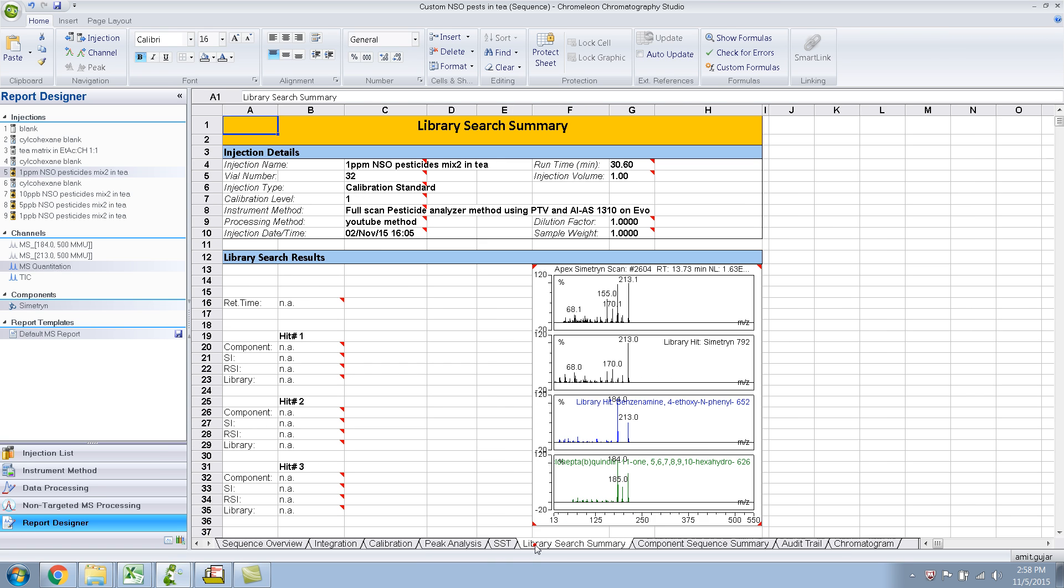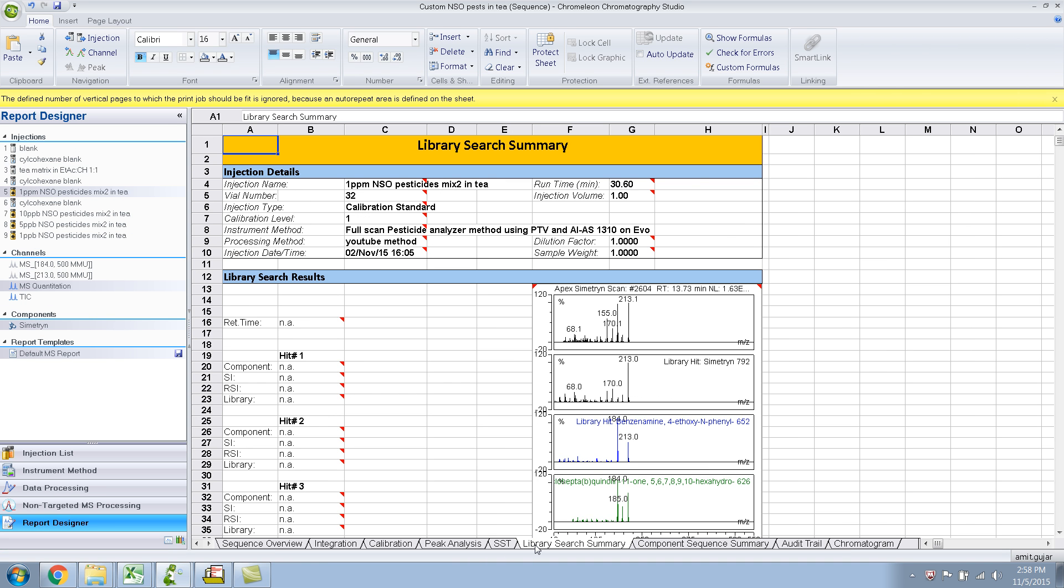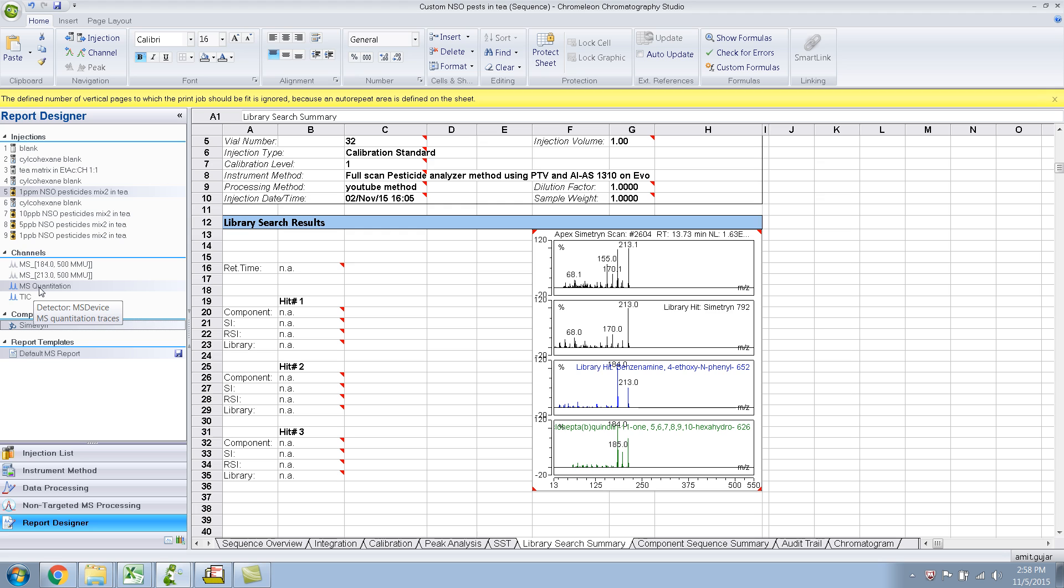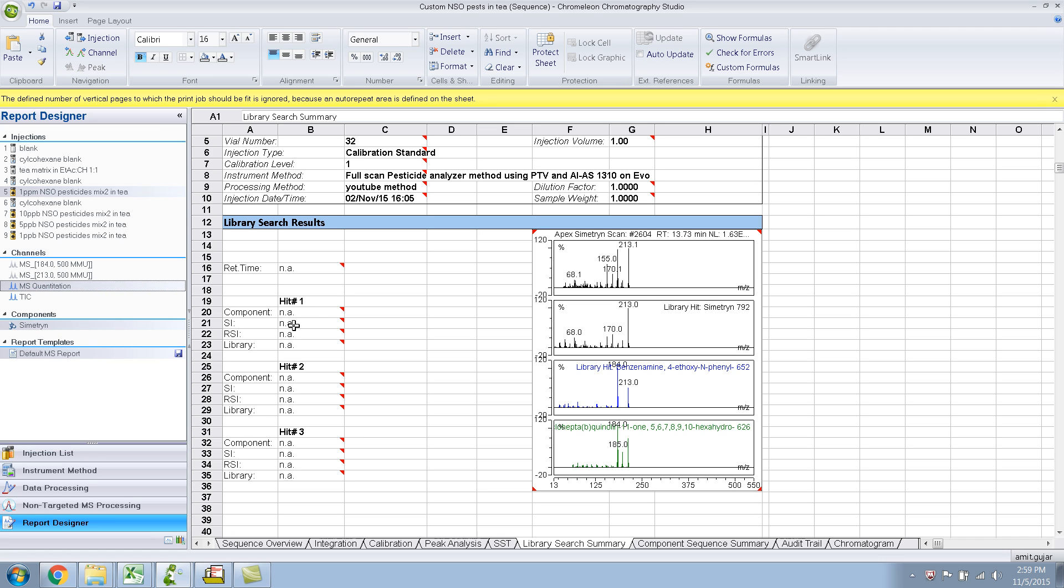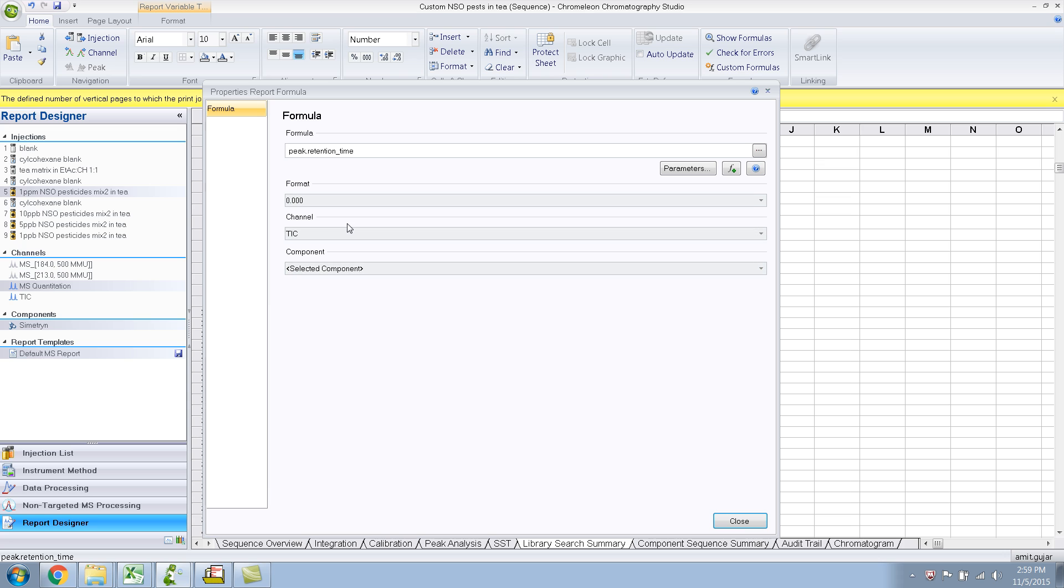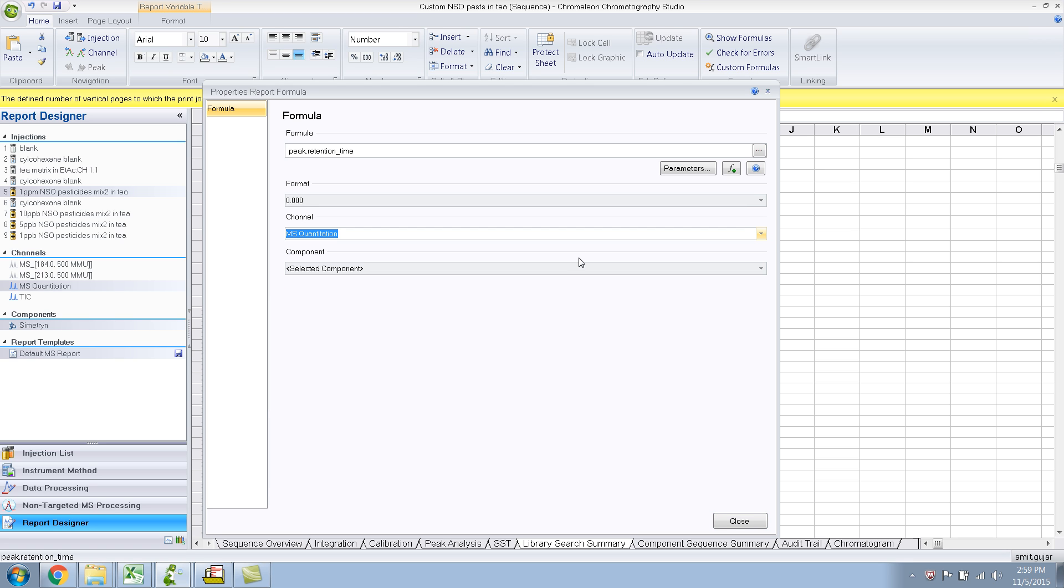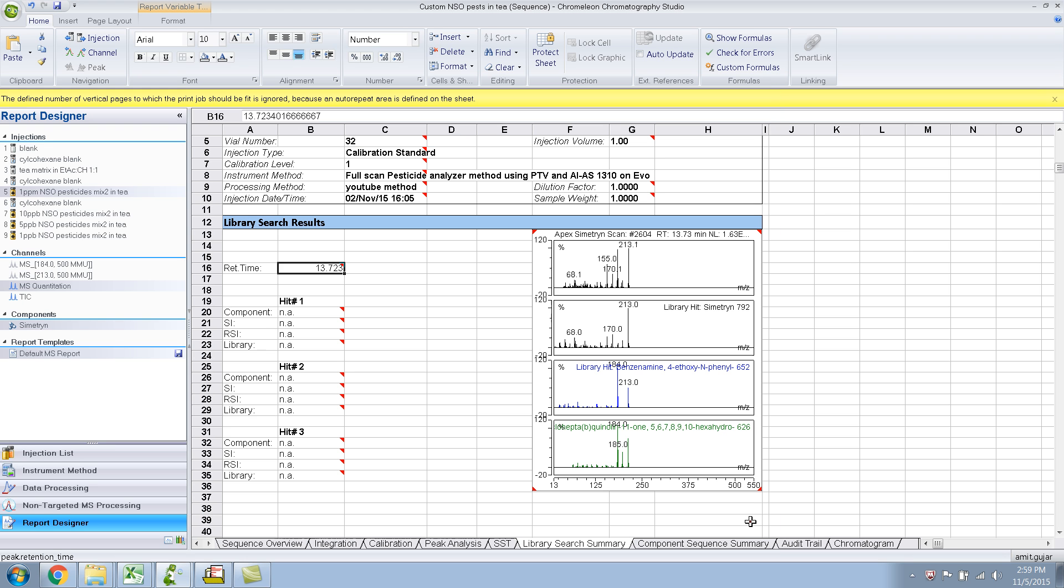And library search summary, so this is the search results for the peak, the Cimetrin peak. Now, retention time, it says NA. I think that's because we have selected the MS Quant channel and library search is generally done on the TIC channel. So, if I do TIC, it will, no, it does not. Okay. So, let me double click on this and see what's happening. Double click, it gives you this formula editor. Peak.retention time, that's fine. Channel is TIC. So, let me, I think we want to select MS Quant channel, and selected component. So, the selected component is Cimetrin, which is okay. So, I close this, okay, so the retention time shows up.